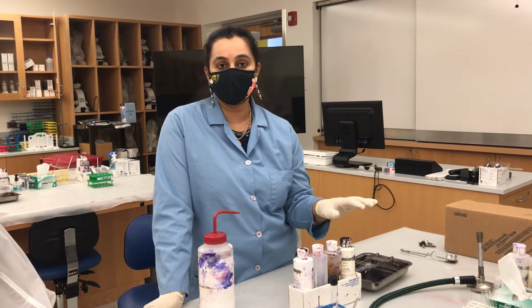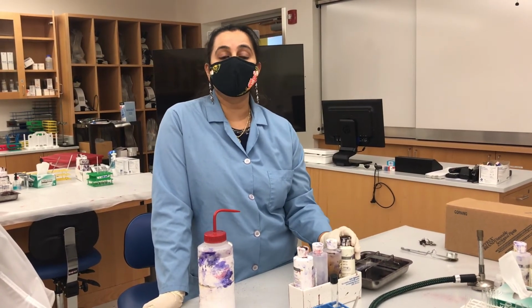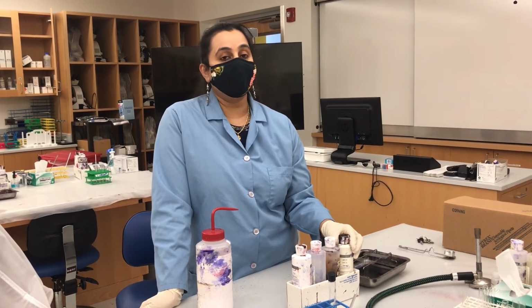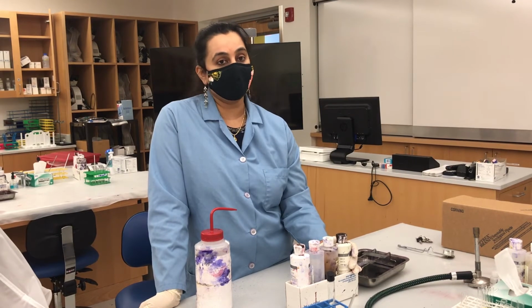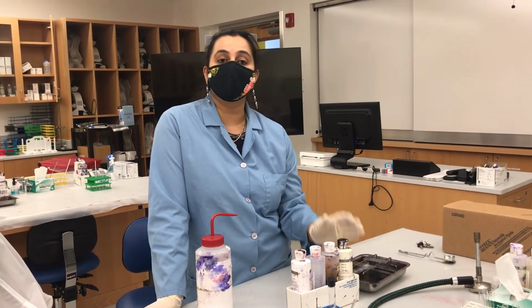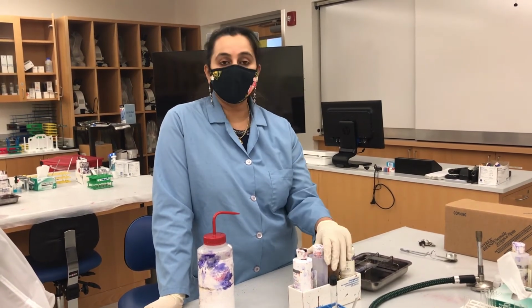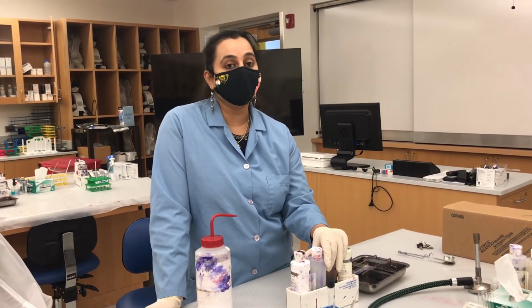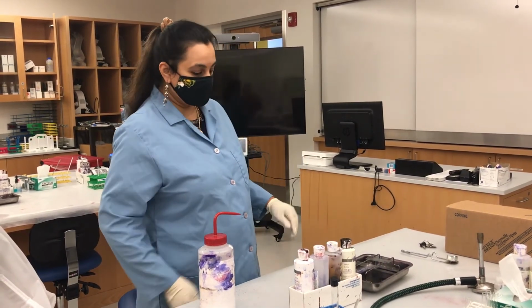So that's an exception. And yet another exception: some cells are known as gram variable. When you try to stain them using crystal violet and safranin, some of them will take up the purple stain, some of them will take up the pink stain. Those kinds of cells are known as gram variable. So always remember, there are exceptions, but the majority of the time gram-positive cells look purple and gram-negative cells look pink. All right, let's start the procedure.